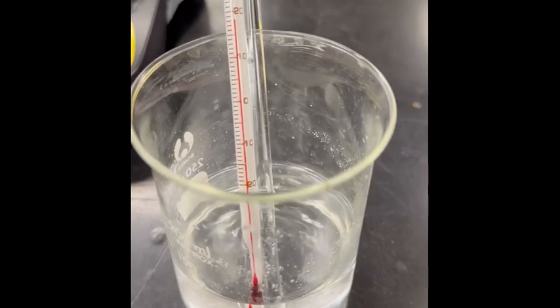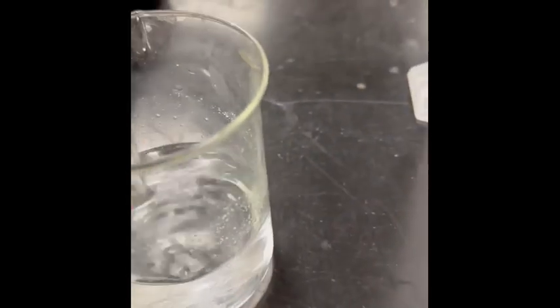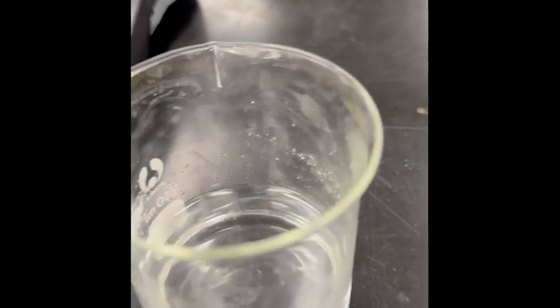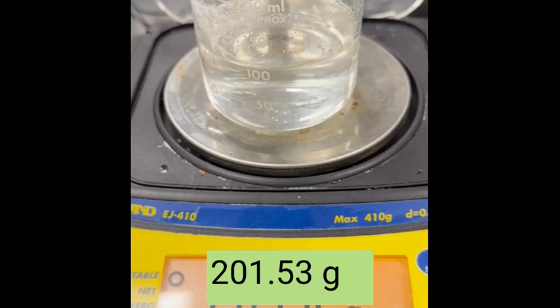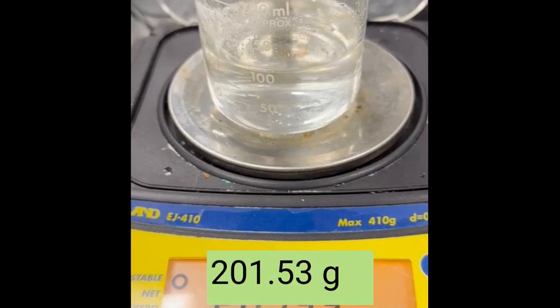Okay, so what we need to do now is reweigh the beaker and water again. And we get a mass of 201.53.